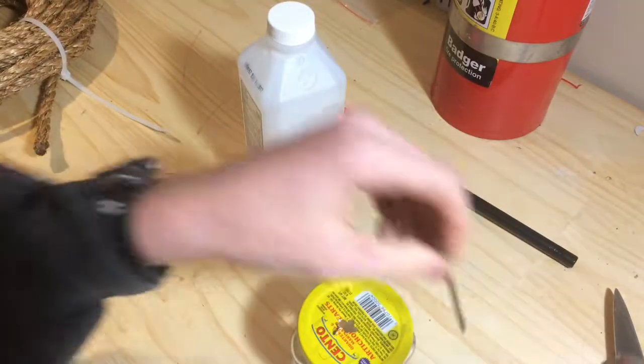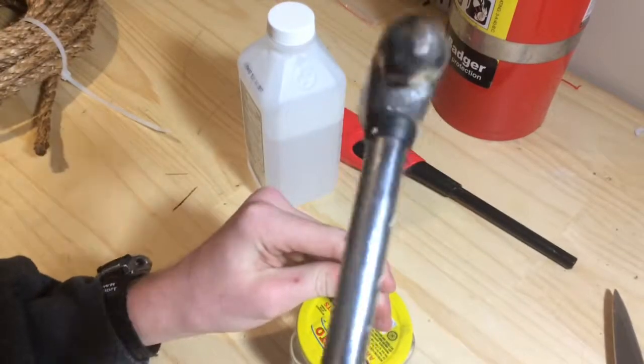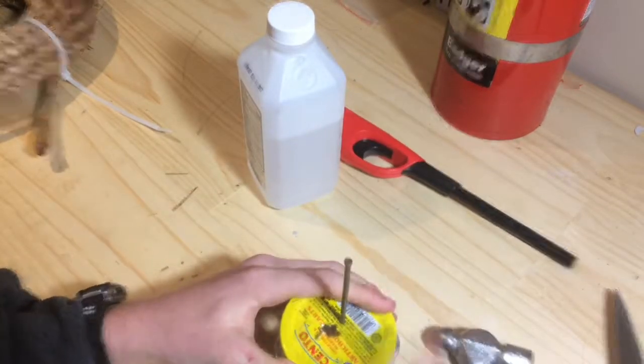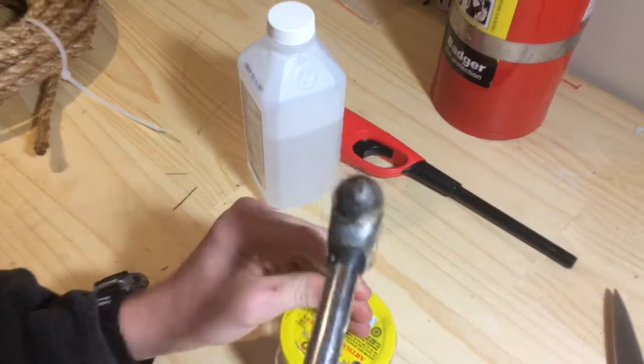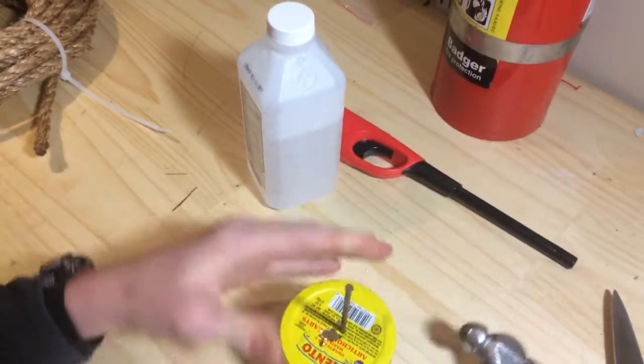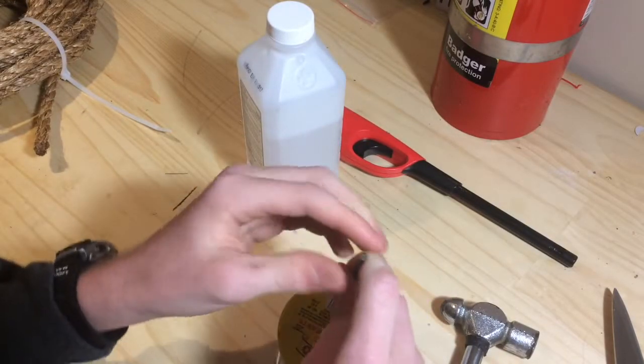So we're going to need to do another hole. The only problem is you don't want the holes to be extremely big, because you don't want the alcohol going all over the place.